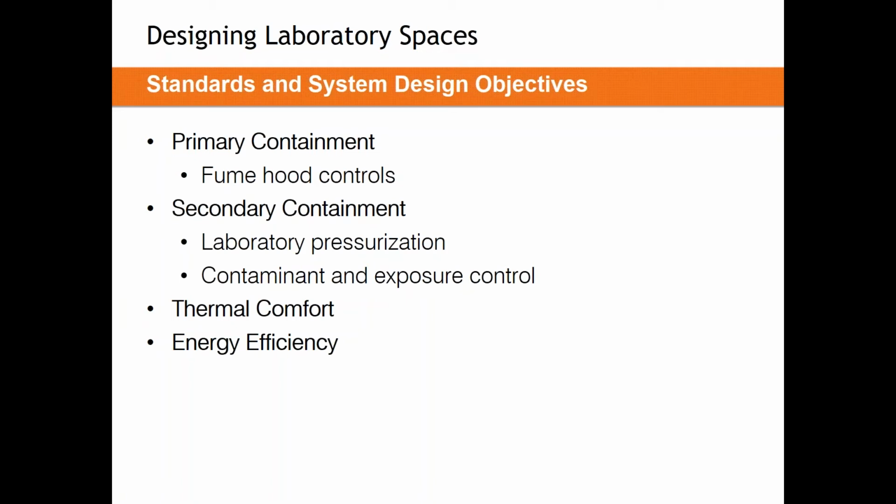The only thing that can protect the actual worker at a fume hood is the fume hood itself. The laboratory doesn't really protect that person. The lab itself will help to dilute the exposure in that laboratory, but it's mostly there, the laboratory and its pressurization, to protect the building at large, to protect the others outside of that space from being affected by that contaminant and that exposure.